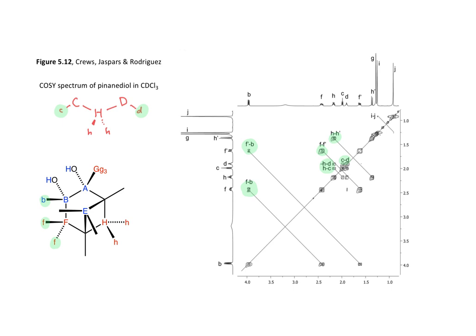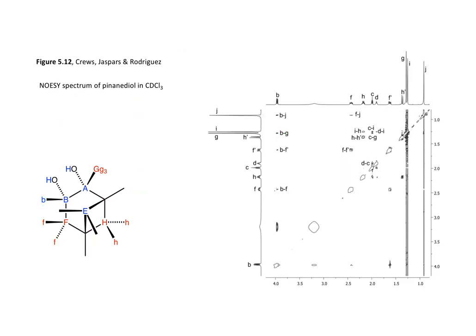From the chemical shift, we might tentatively hypothesize that carbon C and the corresponding proton are closer to the hydroxyl group than carbon D and its proton D, but that's merely a hypothesis. The NOESY spectrum provides information in addition to what we already know from COSY.